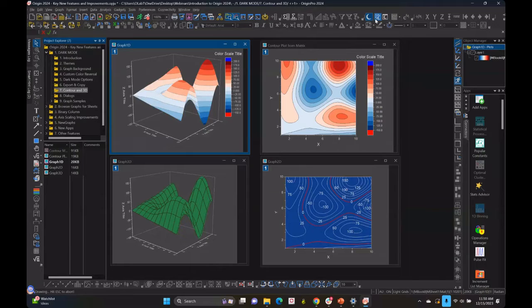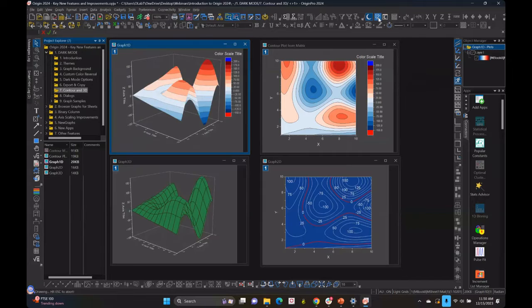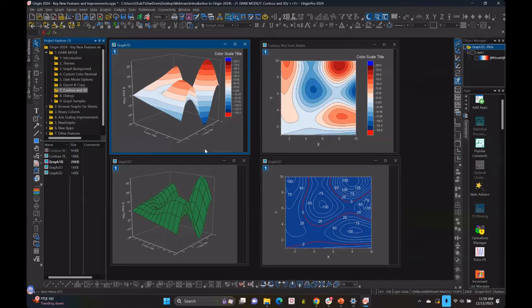We decided that based on our polling with the beta group, and we decided to leave the color maps as they are. In this particular contour plot, you can see I have customized a particular line to be red, the value of 0, and you can see that did not flip. That's mainly because that red color is not in our customized table of mapping. So that color was left alone. So you have the choice to work with color maps as well without having the map flipped on you.